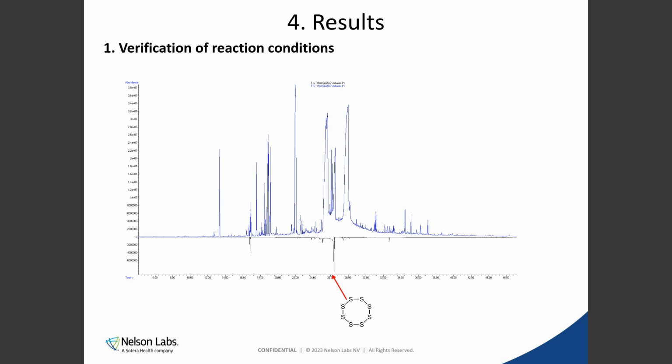react. The next one is a bit more difficult to see. That's the reaction of the oligomer mix with the sulfur. And what you see is that there is a little peak of sulfur before the reaction, but that's still in the upper chromatogram, but you can't simply see it. But if you extract the ion for the sulfur, you see that this reaction is not completely done, so you will have some remainders, not very well visible in the upper chromatogram, but it's still there.